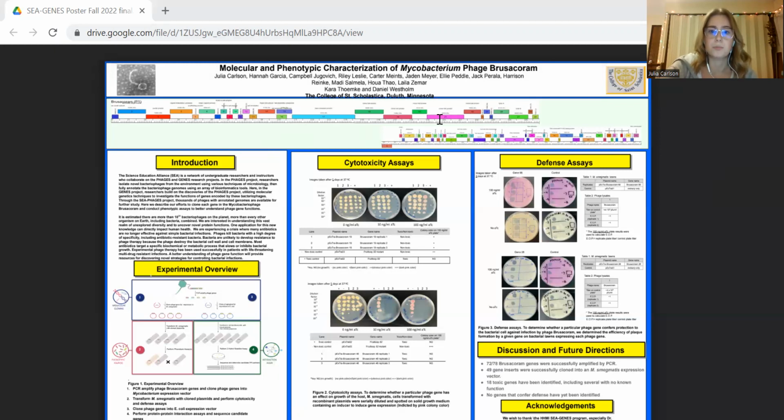So for example, the purple found over here, and even over here indicate the most similarities, while areas that are in red, such as here, here, and over here, might indicate very little similarity. Other colors are assigned at random, but there's really no key given as to what they mean. Some of the genes we did notice on the Phamerator genome map had no known functions compared to others which had known functions.